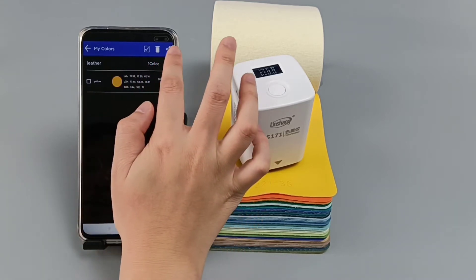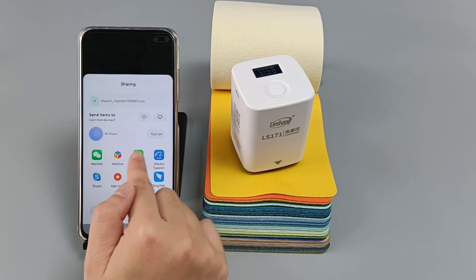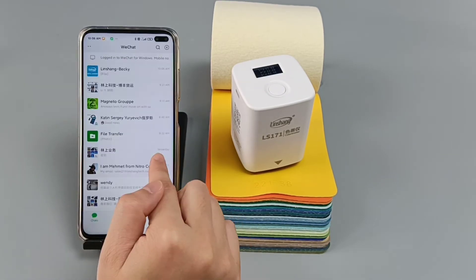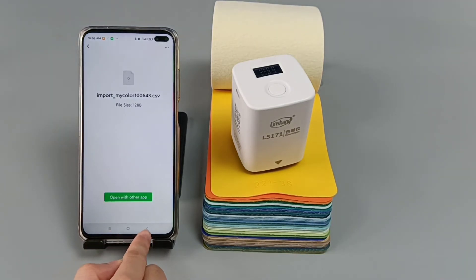Click the share icon and share the color. We can see this is the data of the shared color.